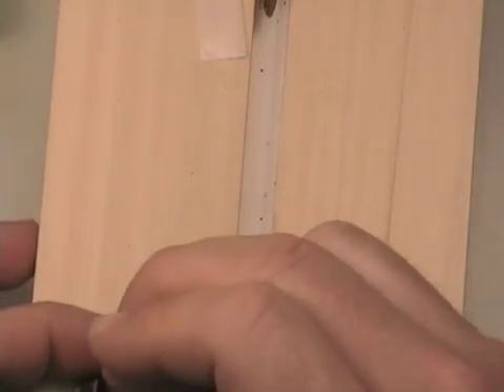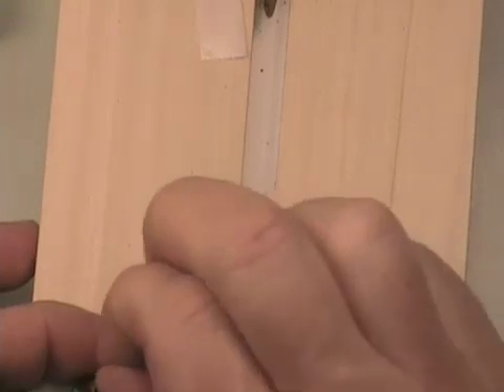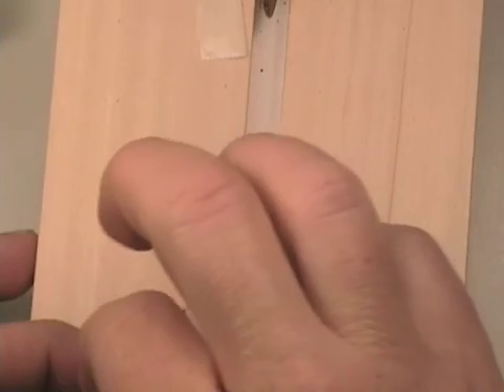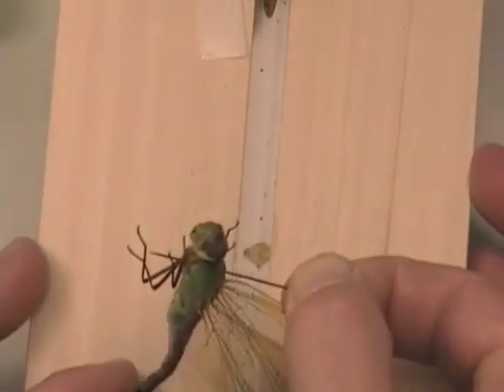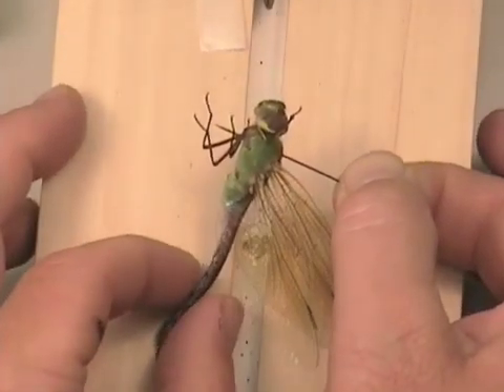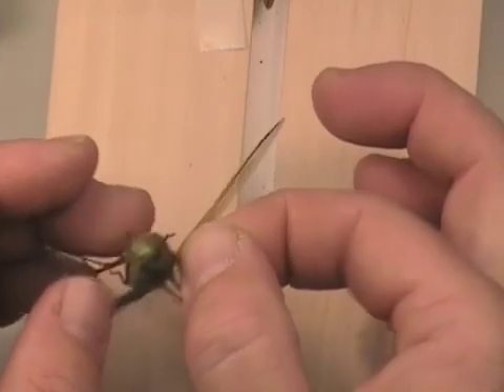Like before, we are going to pin through the thorax — the prothorax specifically — at the anterior end of the body. Dragonflies, because their bodies are so flexible, you just need to be careful that you are getting it at the right position.